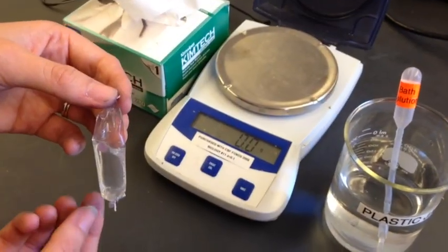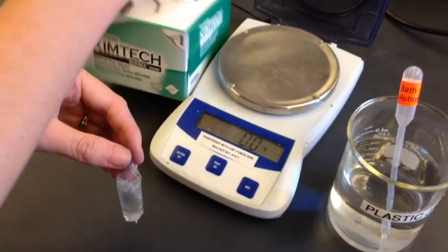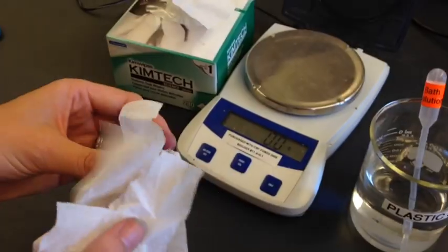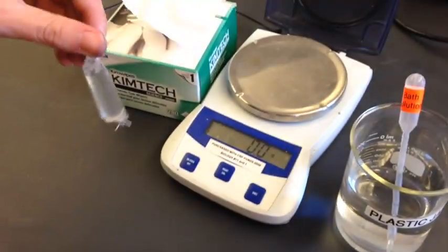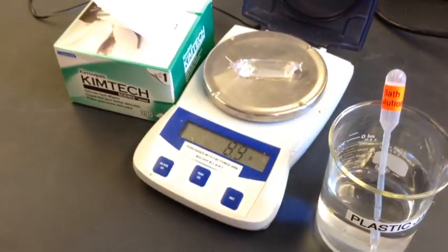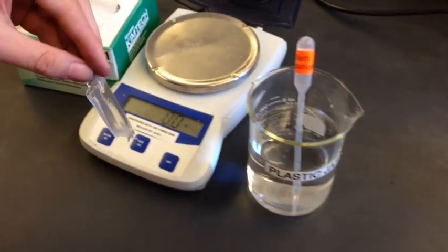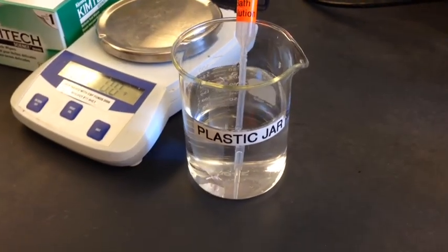After trimming the strings off the dialysis bag, you need to dry and weigh it. Use a Kimwipe to pat down the outside until it's completely dry, then put it on the scale and record the weight. When your instructor gives you the go-ahead, drop it into your plastic jar with the bath solution.